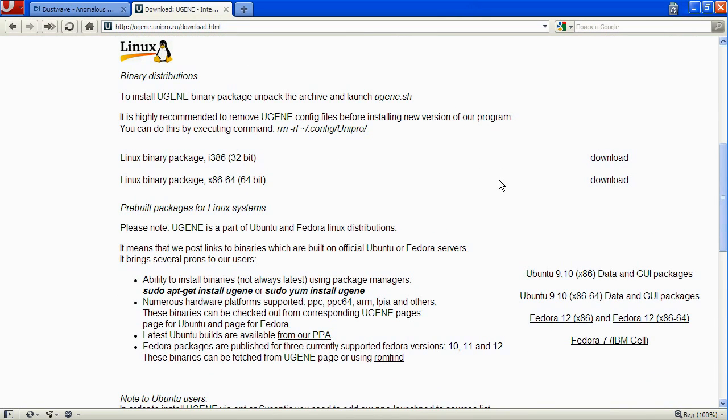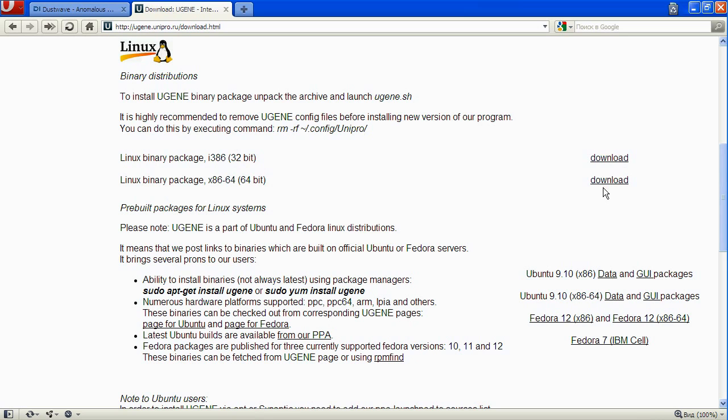All you need to do to install UGENE on your Linux is just to download the corresponding package, extract the files to your local drive, and then simply run the UGENE.sh shell script.